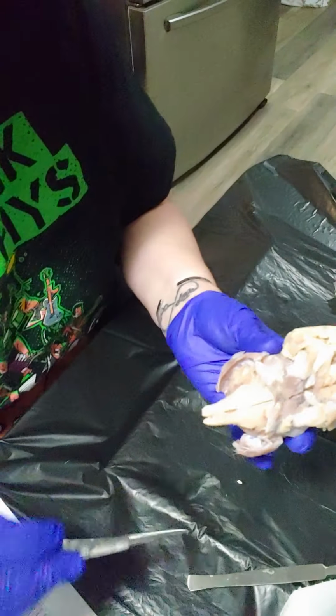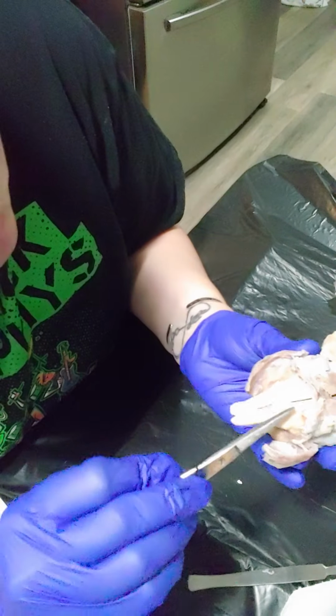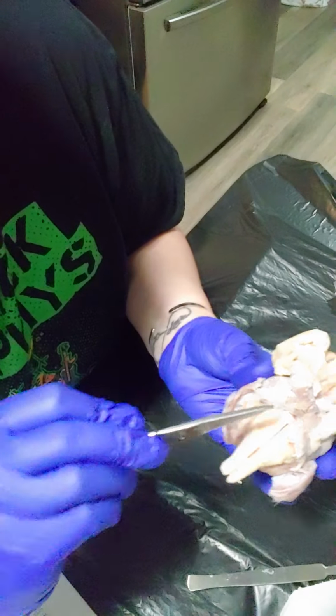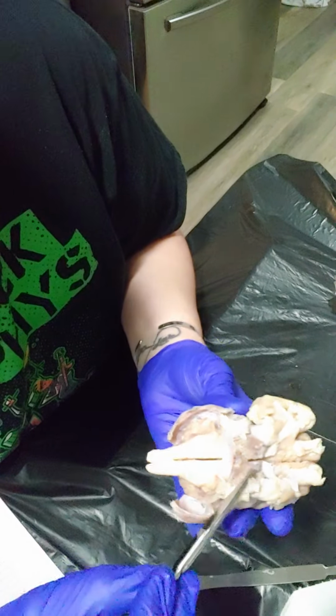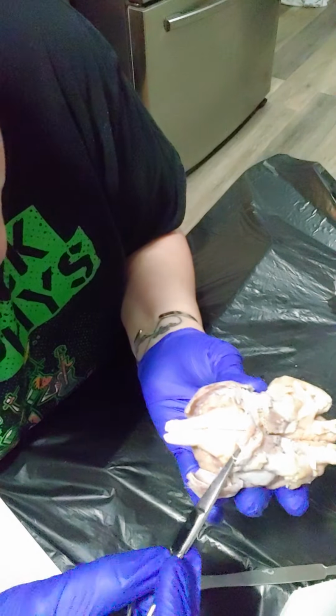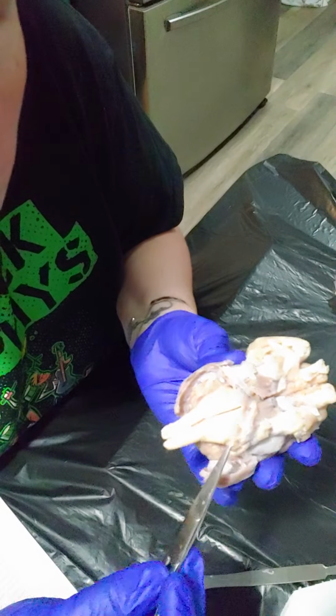And then something I had to look several times to see. You do have a few of your cranial nerves still attached. And this would probably have been a little bit more visible if I could have gotten all this casing off. I was terrified to mess up something I needed. But there are some of the cranial nerves still attached.